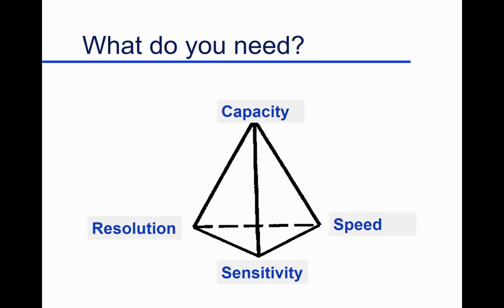If you're thinking about, oh, I want sensitivity and resolution, you're not going to get them. You're going to compromise sensitivity if you want speed. The idea of how big a sample can I put on there, so maybe I can have better sensitivity in my system, it's going to cost us. So you don't get any one of these. You settle for a compromise.